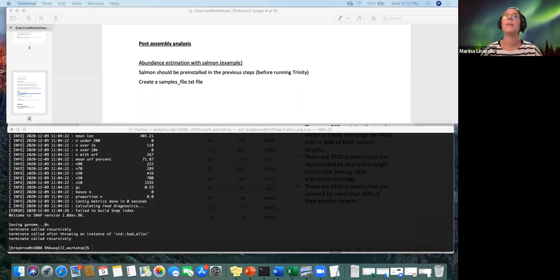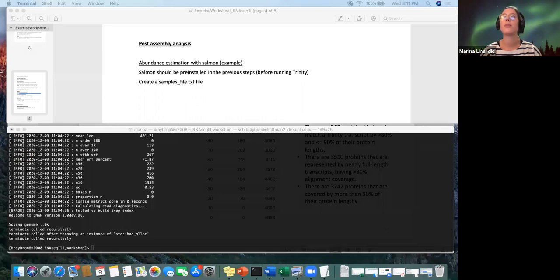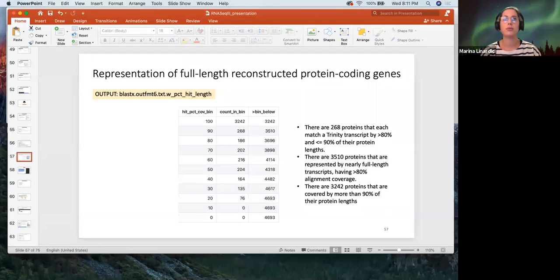Okay, maybe we can continue. I'll send you the link to the quiz to the email later, but you have it in the chat if you need it for later. Okay. So let's continue with the presentation. There's a few more things on the slides that I wanted to show you.